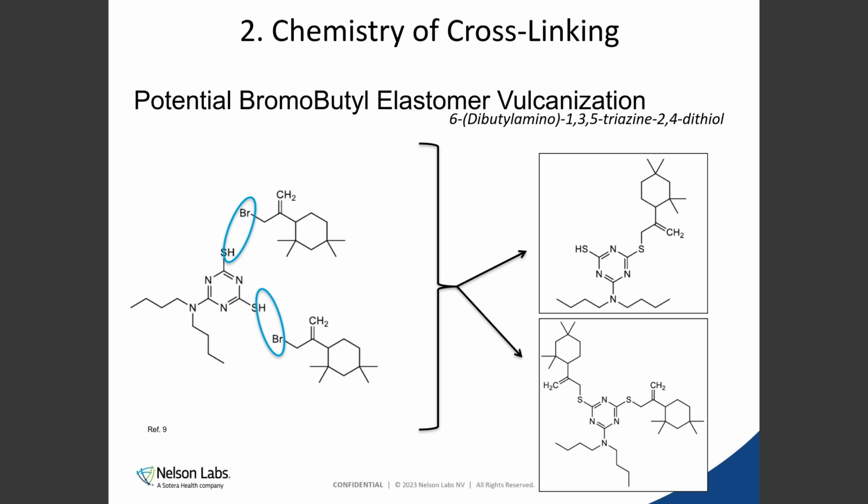Well, you do not always have the full polymers there, and that is essential, of course, for our investigation, because you will not be able to put that in an analytical instrument. But you always find some kind of smaller fragments, meaning those little C13 fragments, and you also have the same principle with C21, but they can react the same way with the cross-linker as the polymer itself.